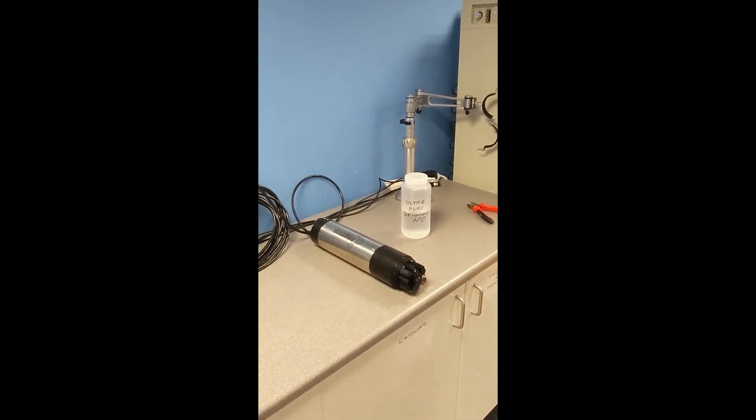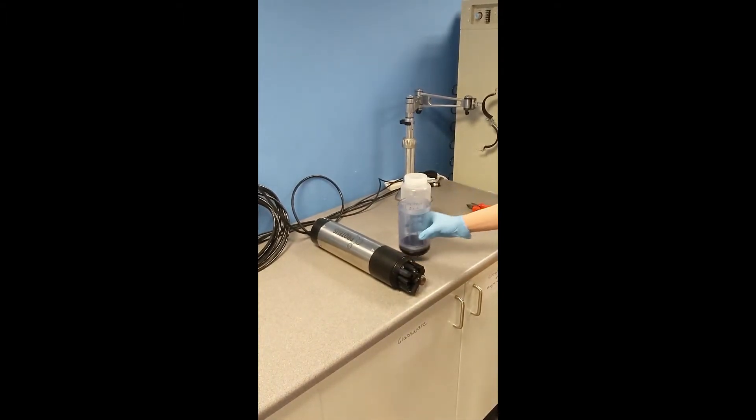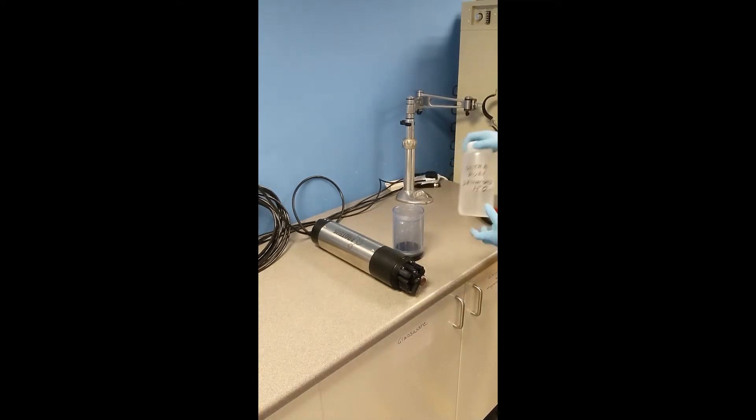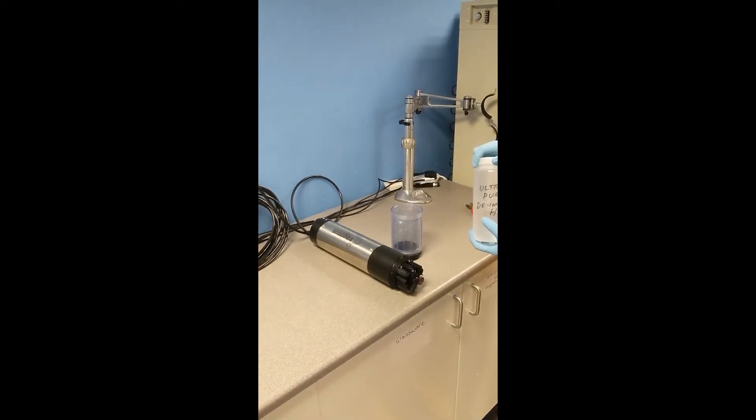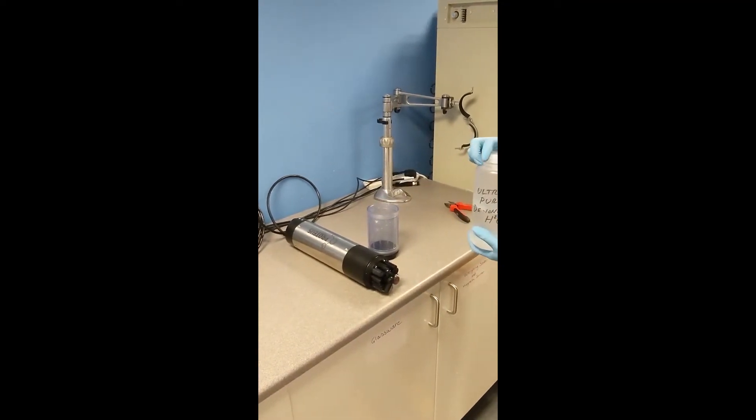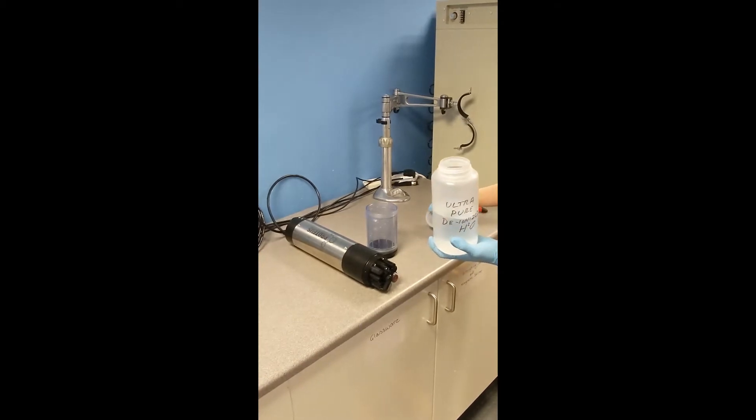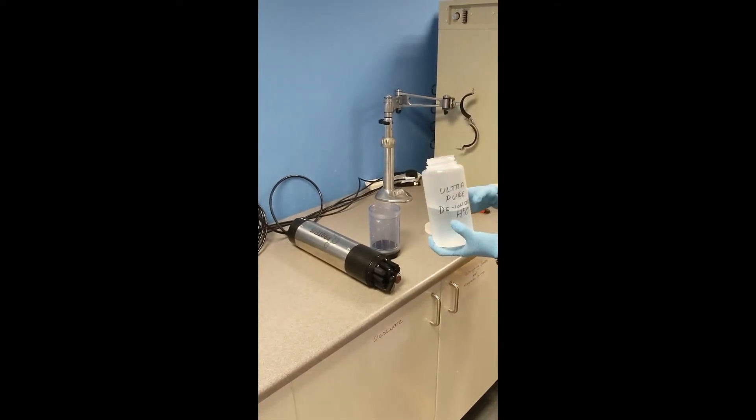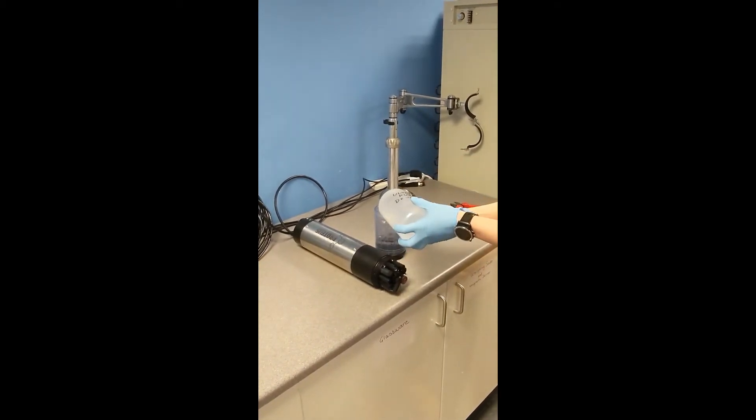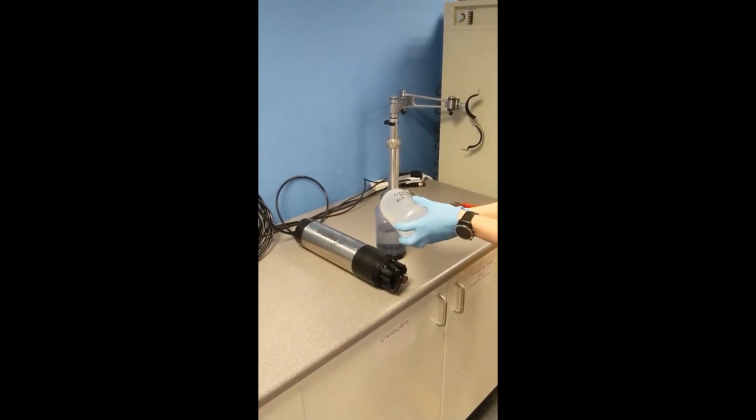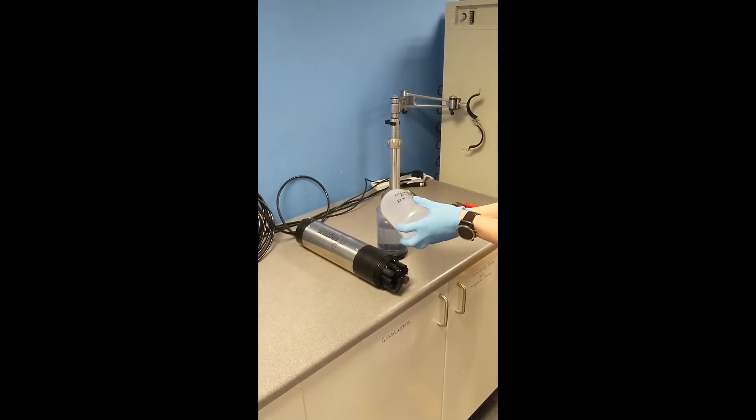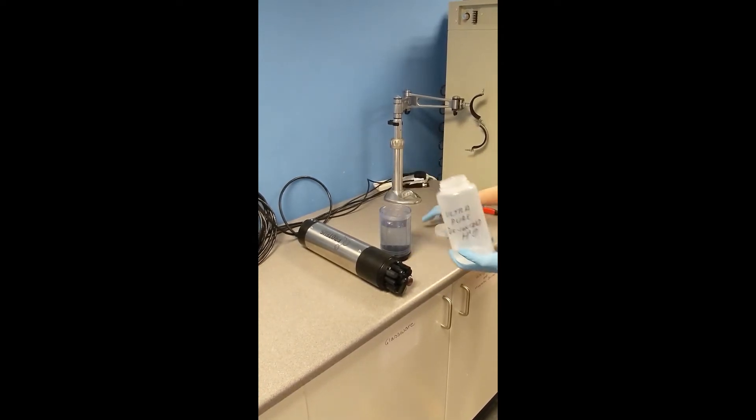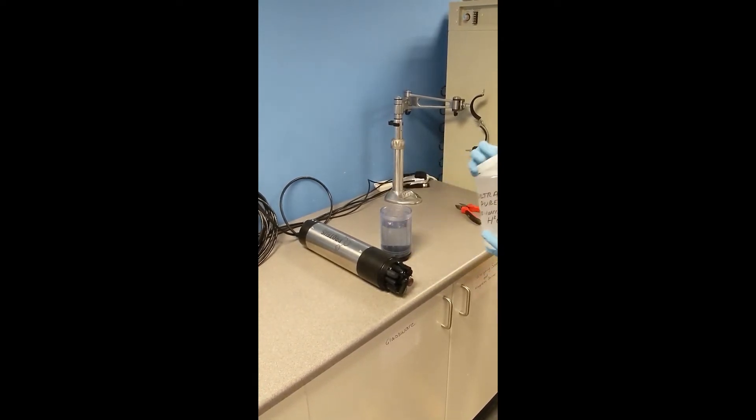Now we're going to fill up the calibration cup with the first calibration fluid. With turbidity, you just need to use a fluid that has no level of turbidity, so in this case we're going to use deionized water.